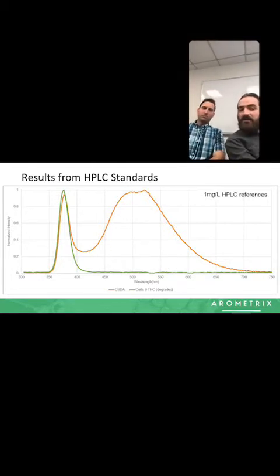Another thing that we tested was we left that delta 9 HPLC standard out on a table in the sunlight, and as any of you that have ever dealt with extract know, if you leave an extract sample in the sunlight for more than like a week, you're not going to really have your cannabinoids left, and we wanted to see what would happen.